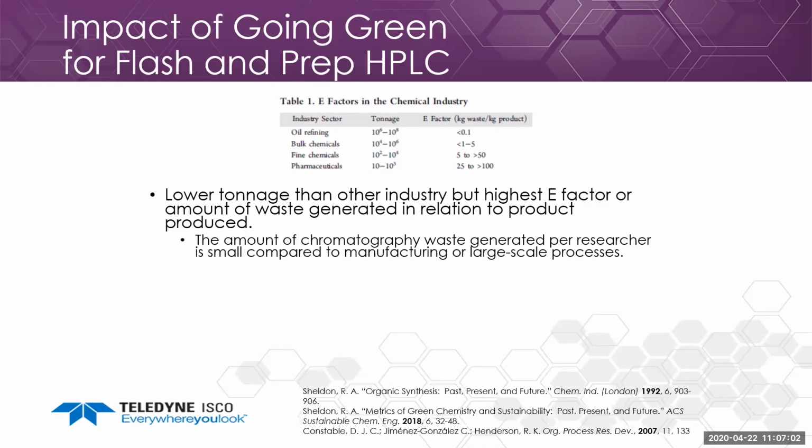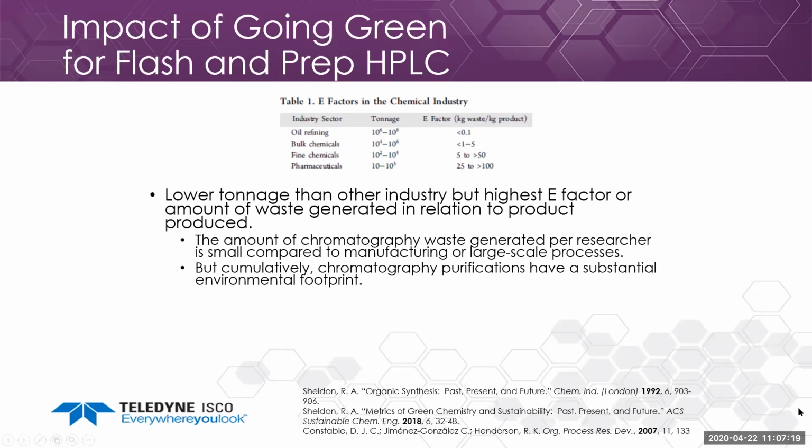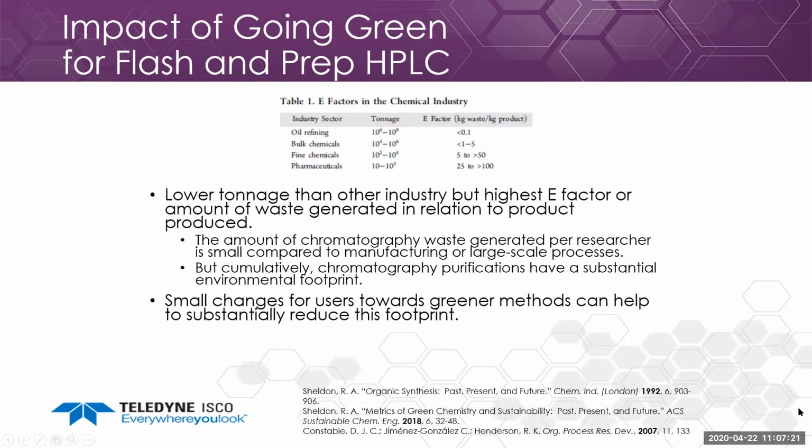So the amount of chromatography waste generated per researcher is small compared to manufacturing or large-scale processes, but cumulatively, chromatography purifications have a substantial environmental footprint. Additionally, these small changes for users towards greener methods can help to substantially reduce the footprint. Also, when things get upscaled at the manufacturing process, maybe these changes can be implemented at that point also and have a greater effect.